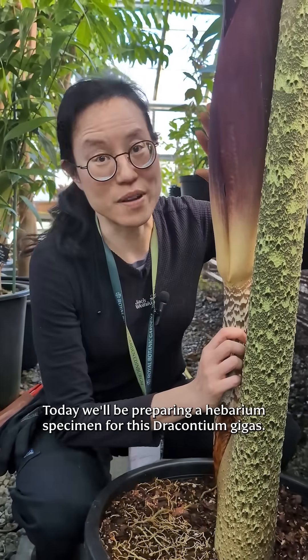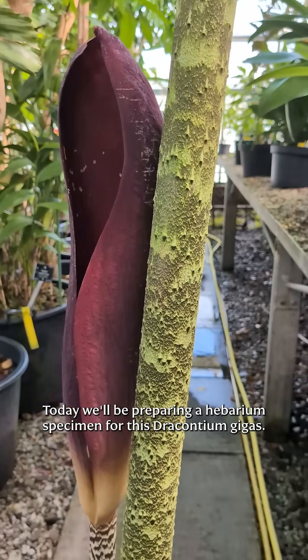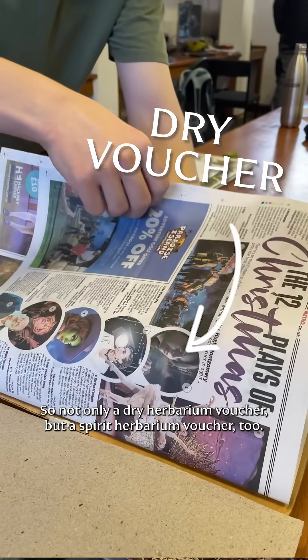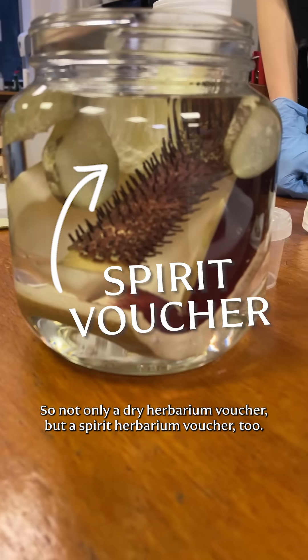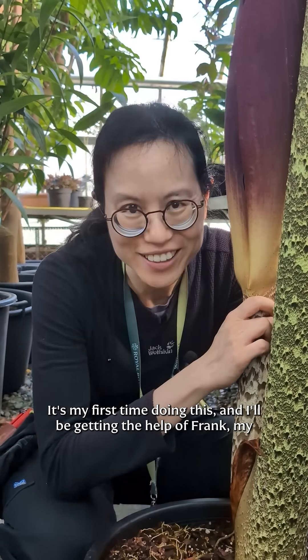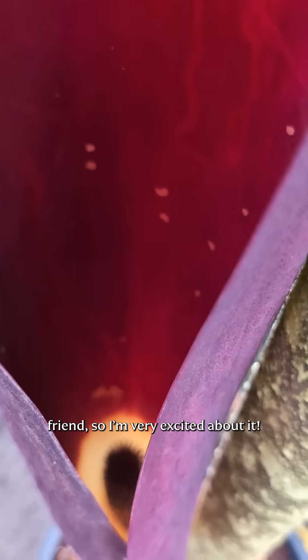Today we'll be preparing a herbarium specimen for this Draconium gigas — not only a dry herbarium specimen but a spirit herbarium specimen too. It's my first time doing this and I'll be getting the help of Frank, my friend, so very excited about it.